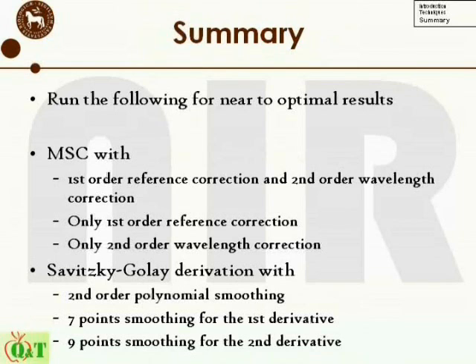Furthermore, we would like to suggest running Savitzky-Golay with a second order polynomial smoothing function. It's 7-point smoothing for the first derivative and 9-point smoothing for the second derivative.